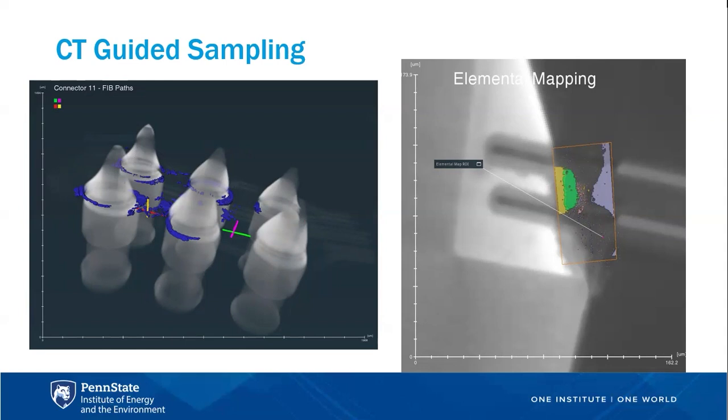Other things that I've done is we had somebody who was doing ancient DNA on sunflowers, looking at domestication of sunflowers in the United States. Unfortunately, we didn't do the CT scans until afterwards, but we were able to see where the seeds were in those sunflowers. That would have been a really great way for them to get better DNA because the DNA was preserved much better in those actual seeds. And they could have done less destructive testing at a specific site without doing as much harm to these irreplaceable samples. So sometimes doing something beforehand that will guide where your sampling is can really help.